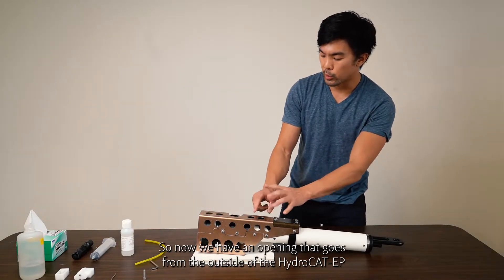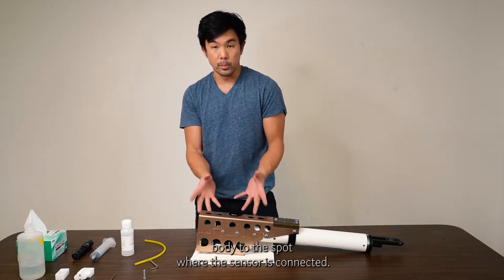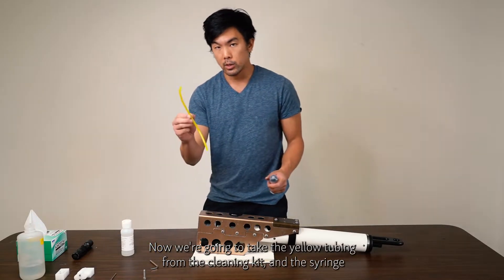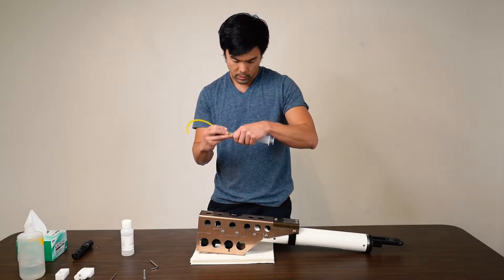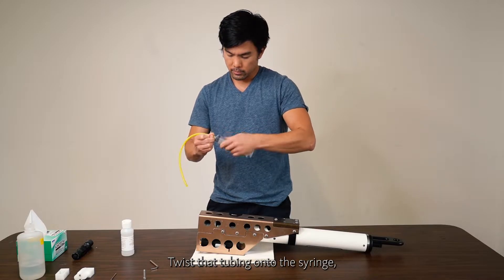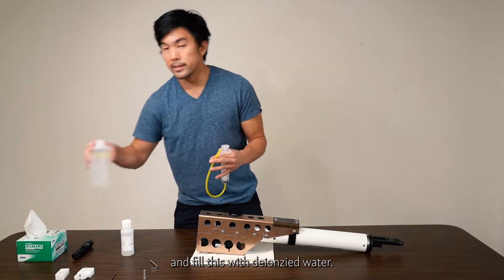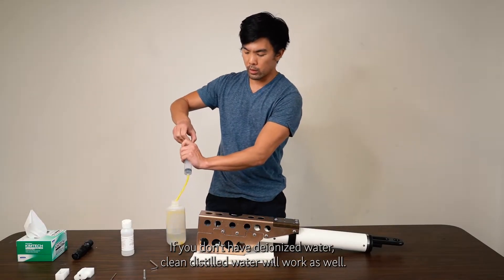Now we have an opening that goes from the outside of the HydroCat EP body to the spot where the pH sensor is connected. Take the yellow tubing from the cleaning kit and the syringe, twist the tubing onto the syringe, and fill it with deionized water. If you don't have deionized water, clean distilled water will work as well.